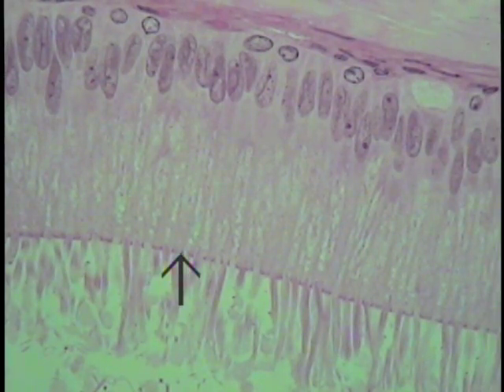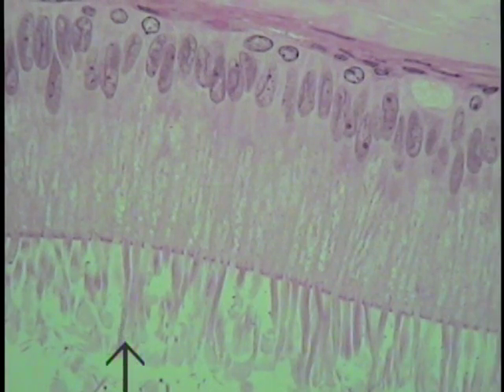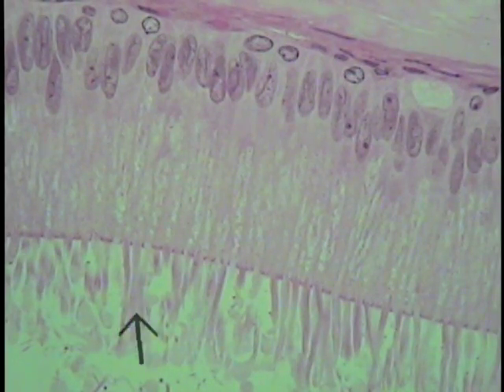Here you can see this wisp of material coming out. These are these so-called stereocilia. Actually, this wisp is an amalgamation. Several of these highly branched microvilli sort of fused or clumped together, giving you this wisp-like indication or profile, morphological feature.